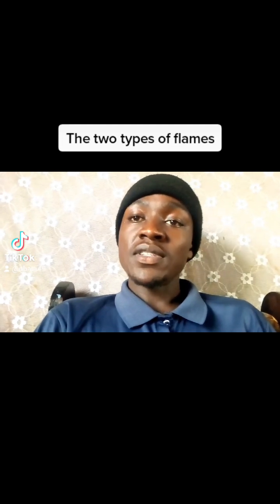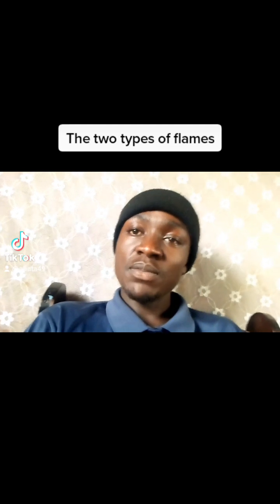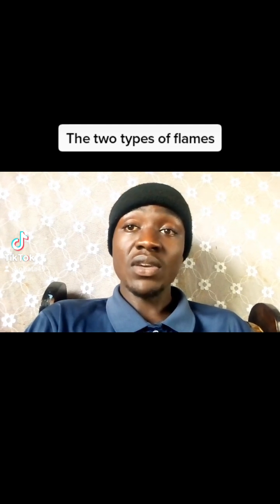Then another focus is the two types of flames that are produced by the Bunsen burner. The first type of flame is a luminous flame, and the other one is the non-luminous flame. A luminous flame is preferred for lighting because it produces much light, while a non-luminous flame is preferred for heating because it produces a lot of heat.